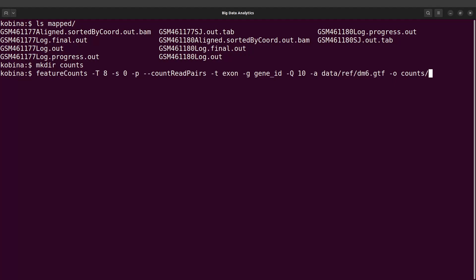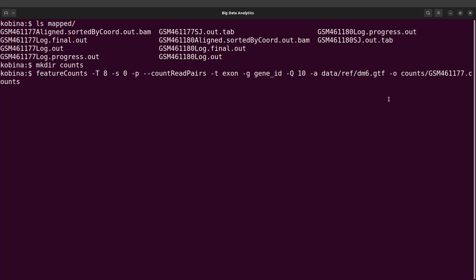Because we want to get a read count for the sample GSM461177, the output file should reflect that name. So we are going to say GSM461177.counts as the file name. So counts/GSM461177.counts will be the output file name. This output file will have the read count information for that particular sample.